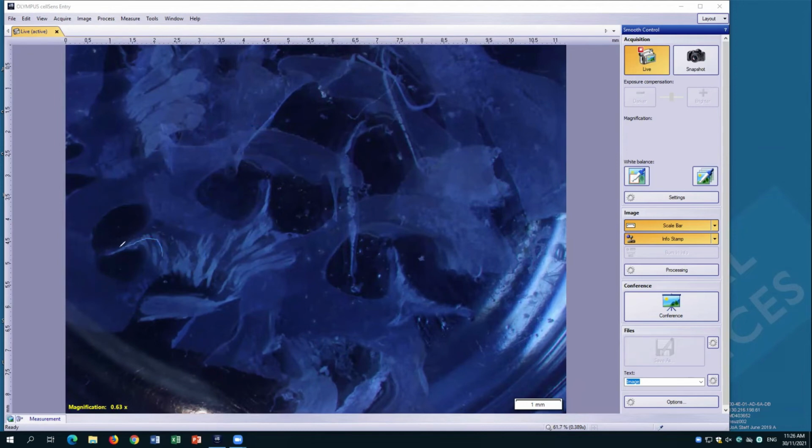You see the white bit with a nerve fiber coming out this way. Basilar membrane and organ of Corti here. This is the spiral ligament or the periphery. This is the center. And we have this cochlear cross-sectional chamber here, one here, and then we have another one here. And so another spiral ligament here, another nerve coming out here, an organ of Corti and basilar membrane here.